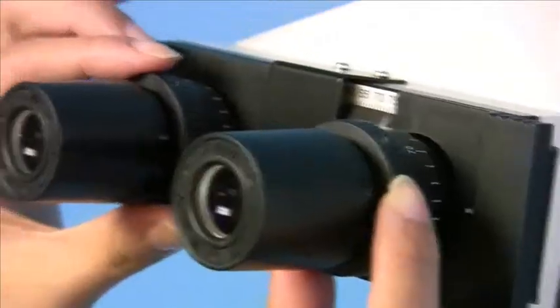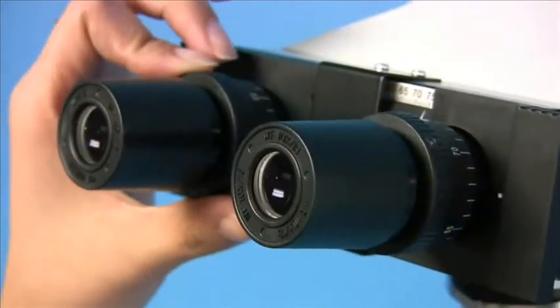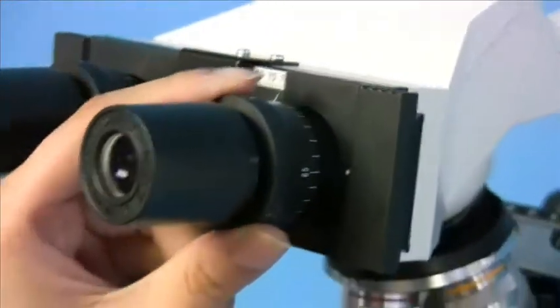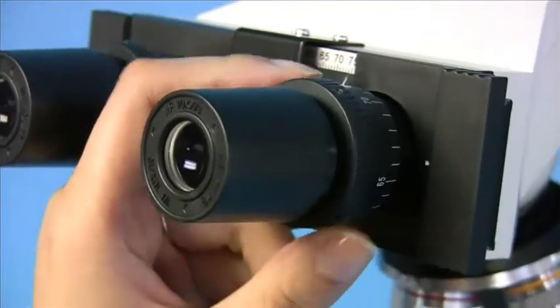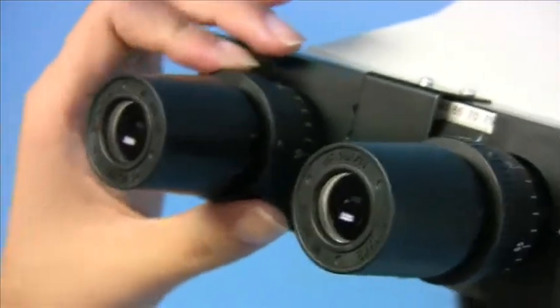Also, the ocular diopter can be adjusted on each eye tube. This feature is convenient for users who have different eyesight. Using this adjustment, they can get the clearest focus image possible.